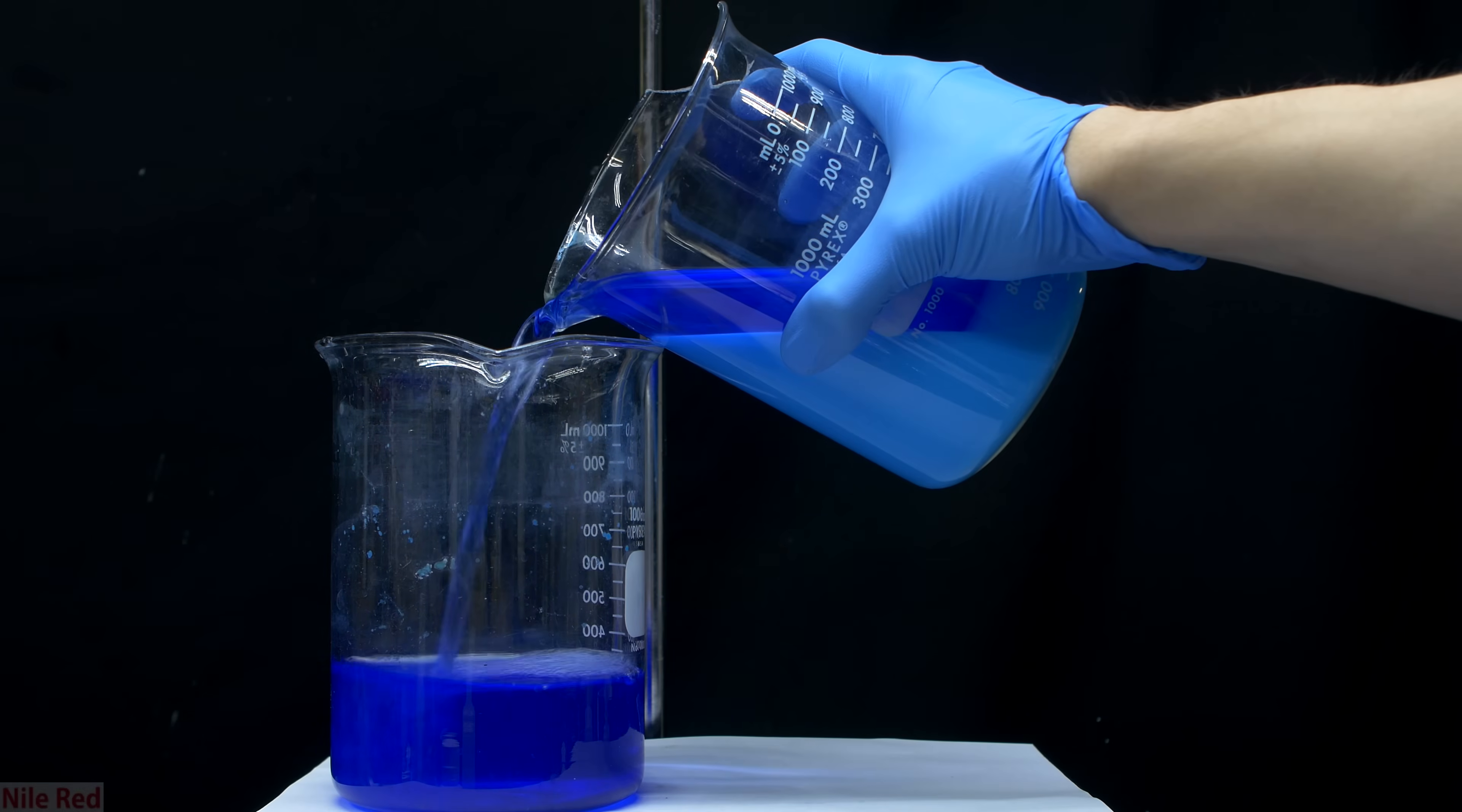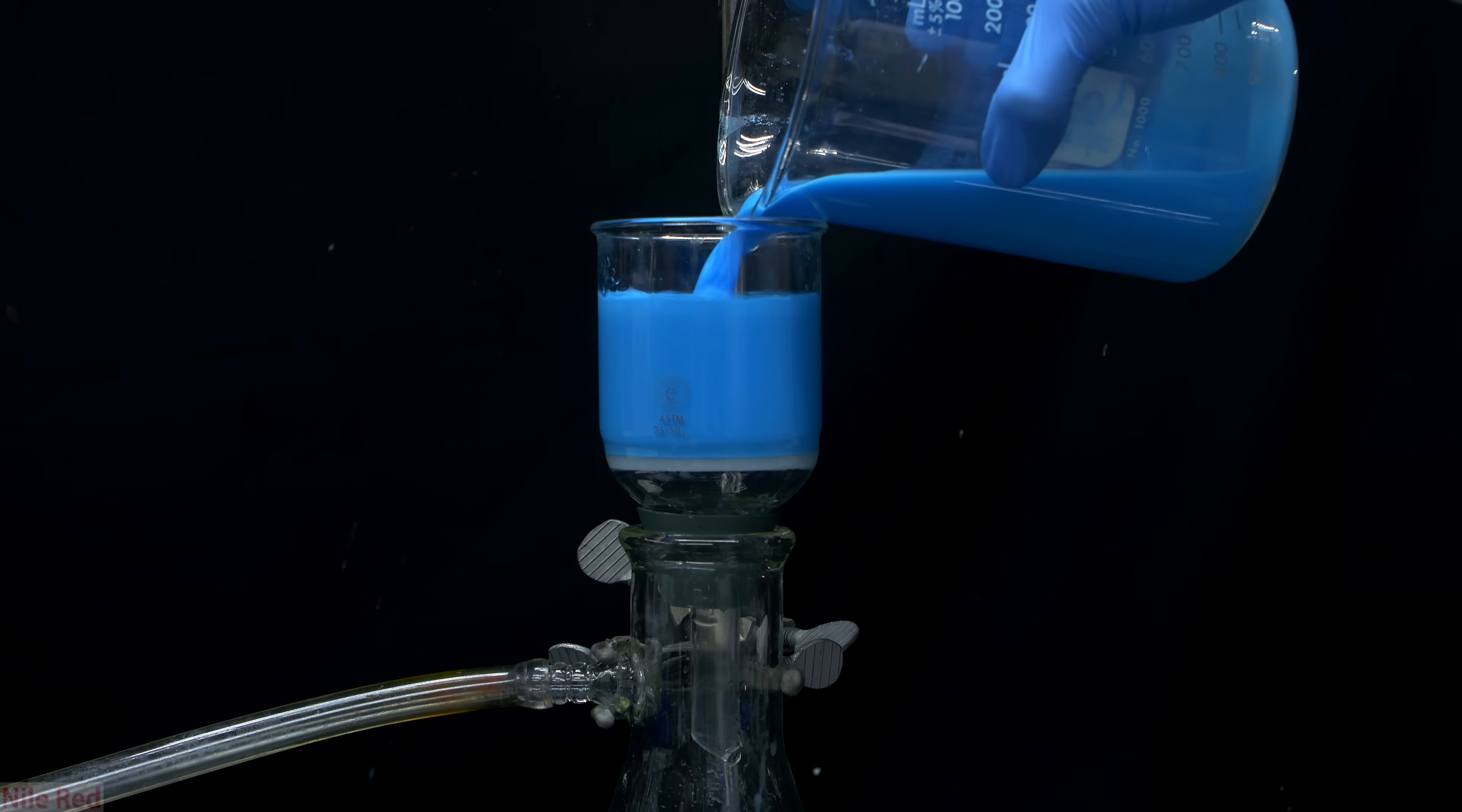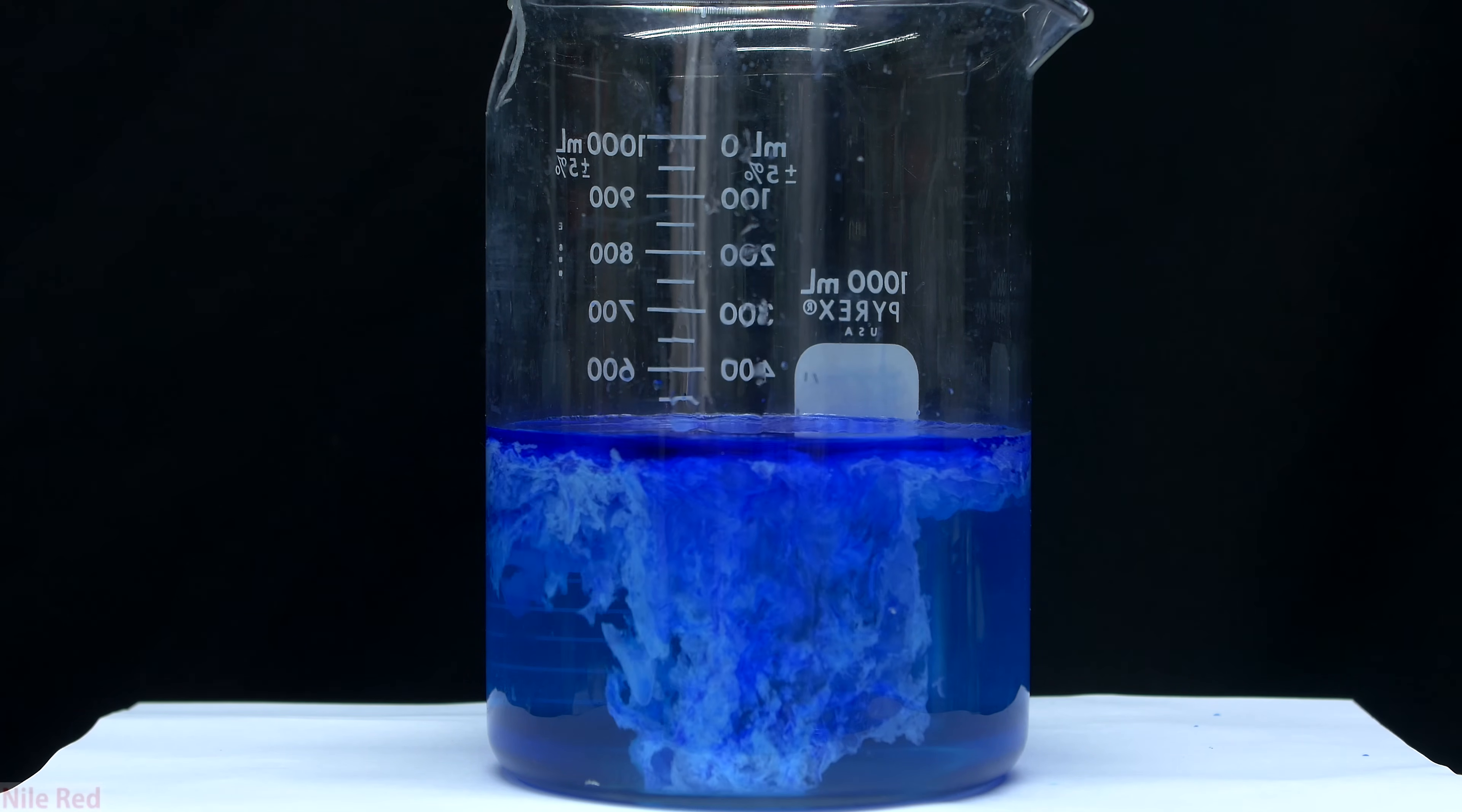Today we're going to be making a little bit of copper hydroxide, which is used commercially as a fungicide or a pigment, but I'm not really interested in that, and I'm actually going to be using it to make something called Schweizer's reagent. I've actually already made a video about Schweizer's reagent, and what makes it so special is that it's one of the few things that can actually dissolve cellulose.